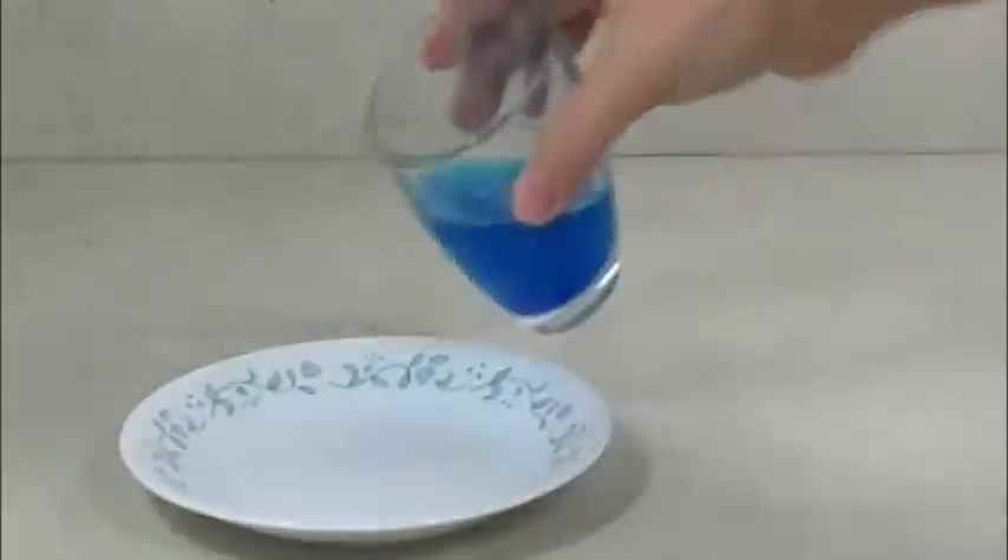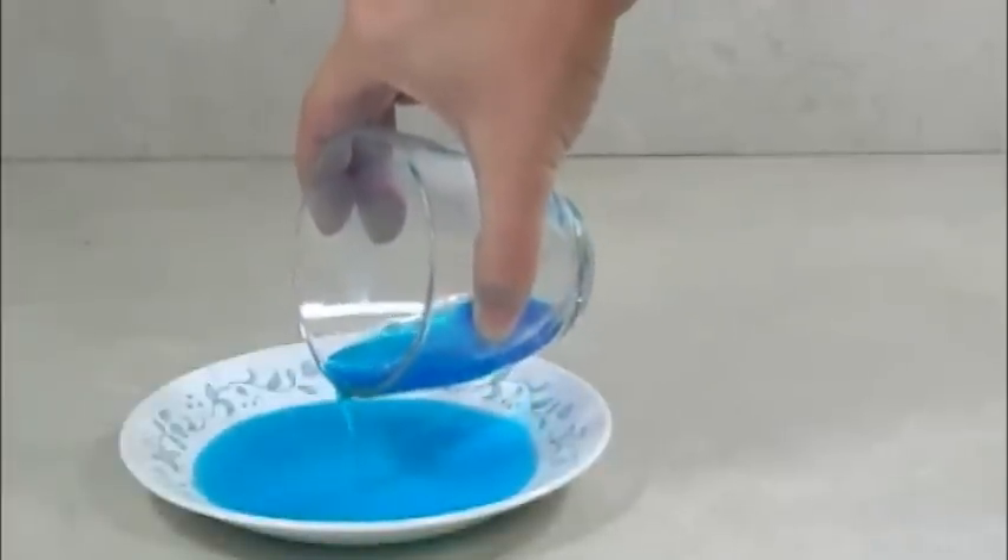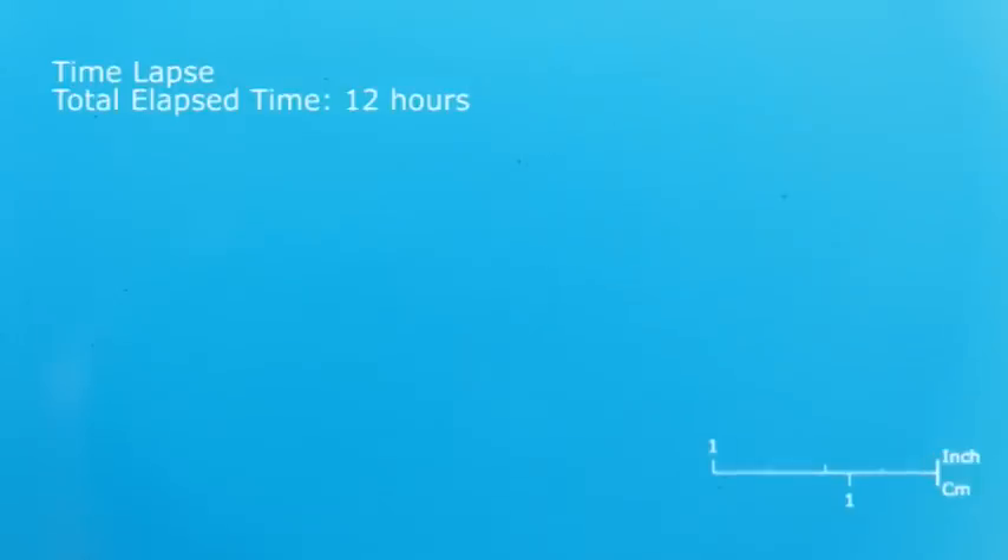Pour the crystal growing solution into a clean container. Try to avoid getting any undissolved solid in the new container. Allow the crystal solution to remain undisturbed. Over the course of several hours you will see crystal growth.